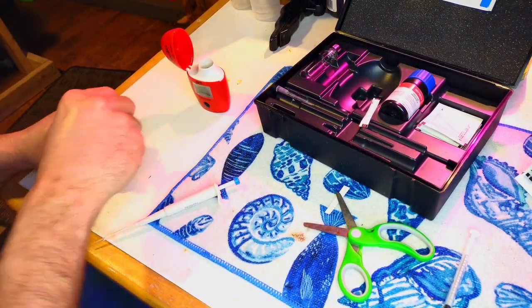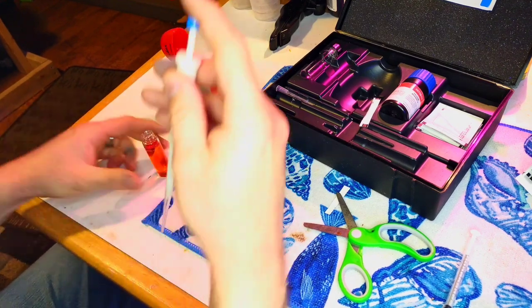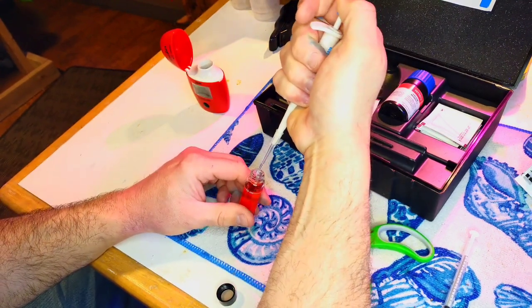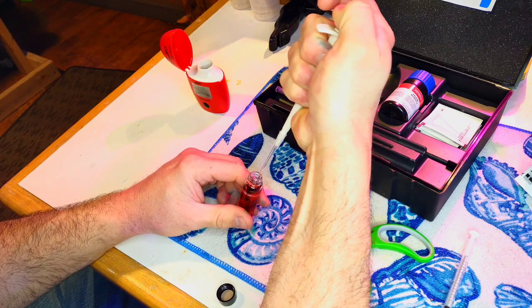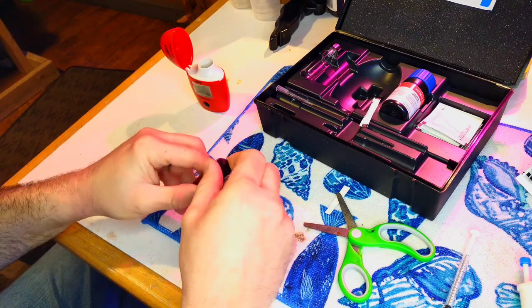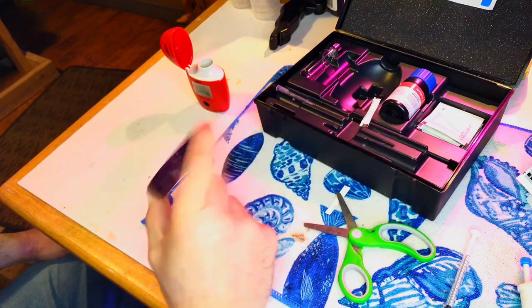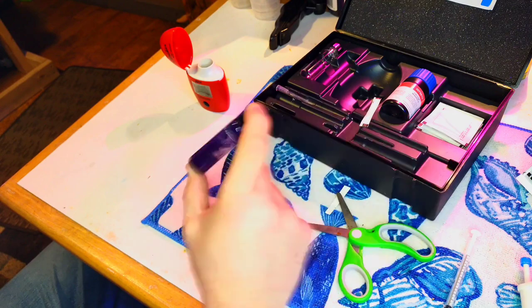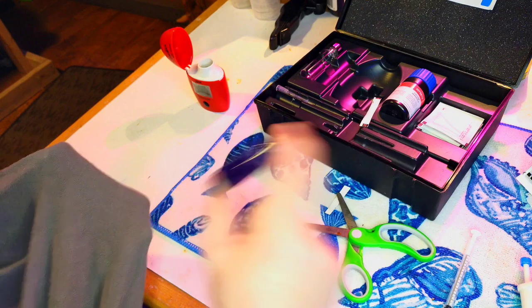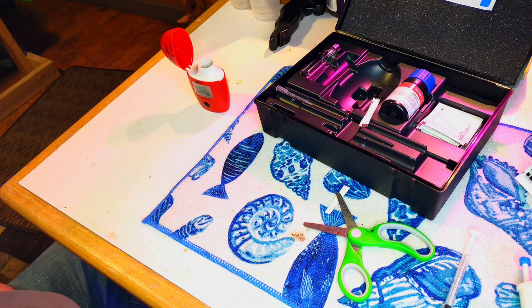Before the tester times out — it shuts itself off after a few minutes to save the battery — push to position two to dispense the last little bit of water into the vial. You'll see this change to a dark purple. Shake it well — the instructions say for 15 seconds — then let it sit for 15 seconds, because the air bubbles introduced during shaking will affect the reading.